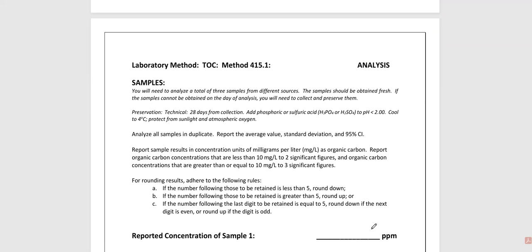Again, nothing formally that we can do necessarily to improve that other than running distilled water. If we run distilled water, then all of this mess goes away. All right. But we've got deionized water in our system. Until we get our ultra purified water up and running, we're running distilled or deionized water.